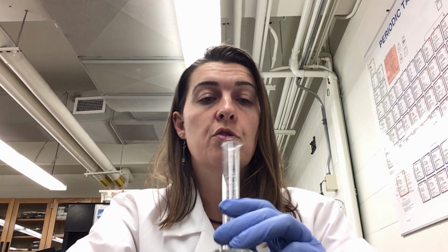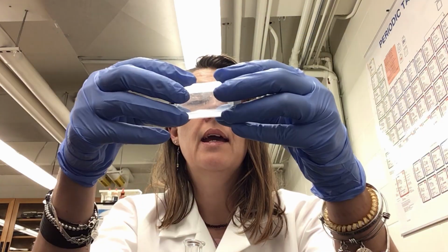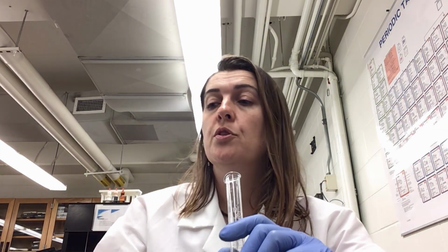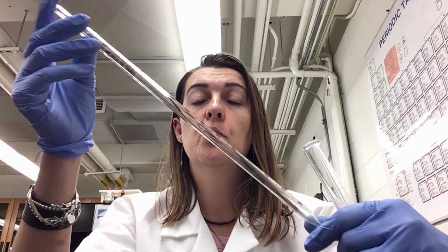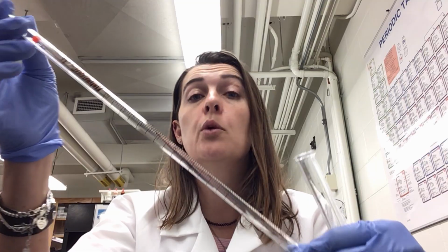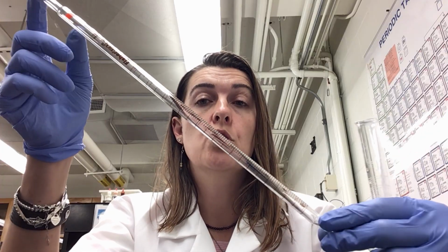At this point, the lab manual, the experiment, says that you need to use the 10 milliliter graduated cylinder to measure 10 milliliters of your solutions, the ones that you just made. You need to transfer them in a plastic vial and measure how much the 10 milliliters of your solutions weigh. I understand that this might be puzzling because we determined in part 1 that the graduated pipette is the most accurate and precise tool for liquid measures. That is true, and in fact, in principle, in theory, this is the one that we should use.